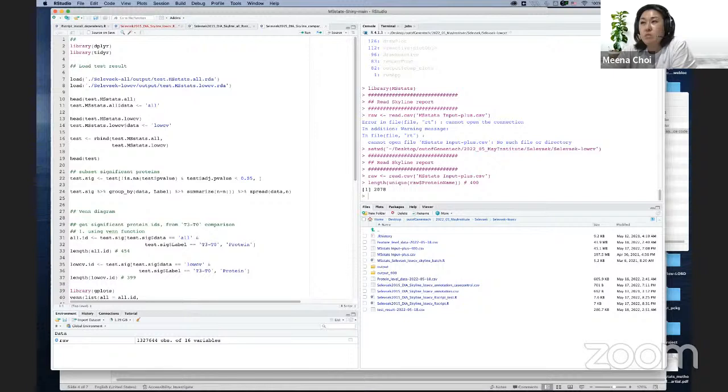Sometimes after summarization, the protein level distribution of each sample is not even. Do you think that we should do another normalization at the protein level? I prefer not. For me, the goal of normalization at this step is just to remove the systematic errors, right? Multiple processing steps are important, but we have to be aware that too many processing steps can actually ruin the data. So that's why normalization is a really key part.